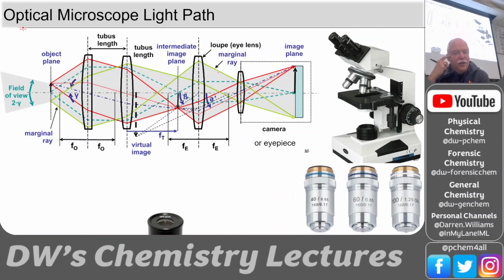This is the internal guts of a simple microscope. You have the image plane here that's placed on the camera. Over here you have the object plane, which is the plane of the object. And this object plane also has a really tight area, depending on the magnification of this focal plane.